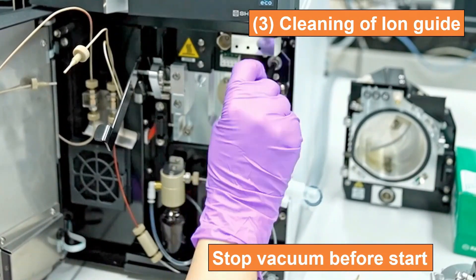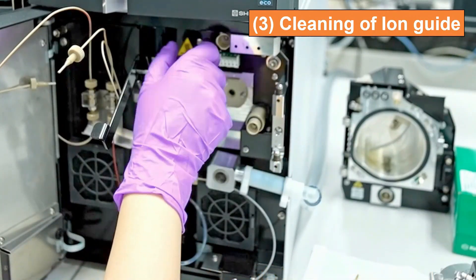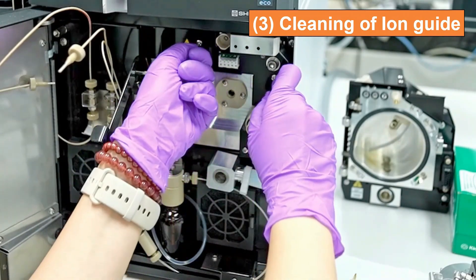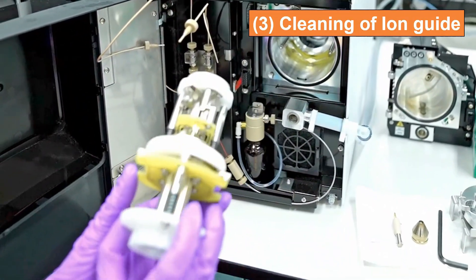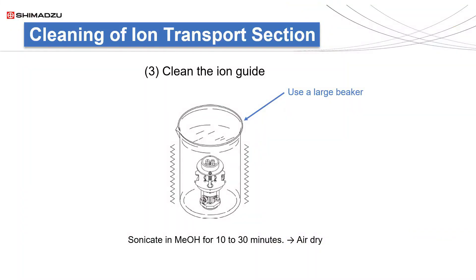Lastly, I would like to clean the ion guide. Before I start, I'll have to stop the vacuum. For regular maintenance, clean the ion guide without disassembling it. Immerse the ion guide in methanol solution and subject it to ultrasonic cleaning for 10 to 30 minutes. Air dry it before it is installed back to the MS.